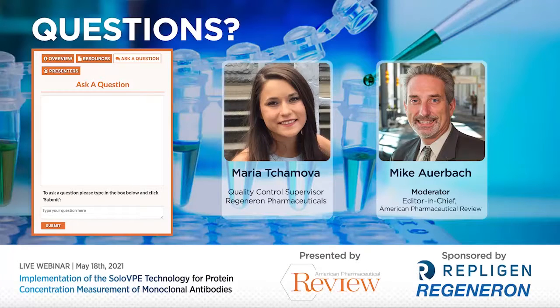How would you handle the validation of new products? Does every new product or matrix need to go through the validation process? That is something that, again, probably depends on the product and the company. In a QC environment, we definitely have to ensure that we're meeting all regulatory requirements. So all the validation data produced for the method and any product that is being released into the clinic has to meet those requirements. And that is what we follow when determining how to handle the validation, what method characteristics have to be evaluated, and if this has to be done for every product.